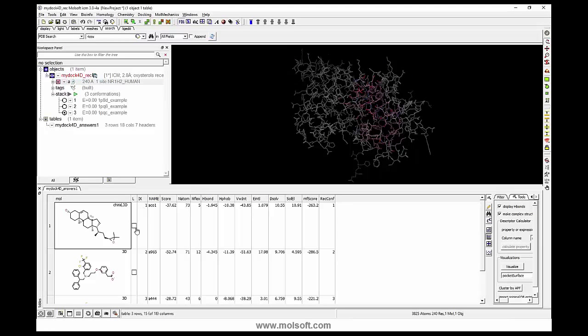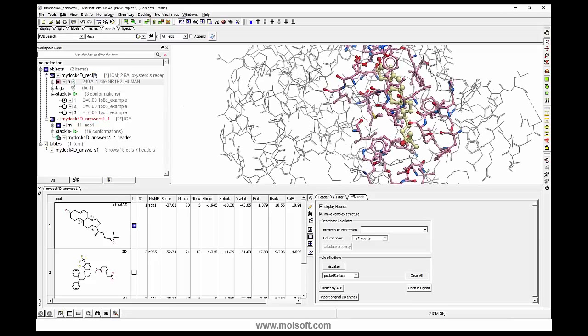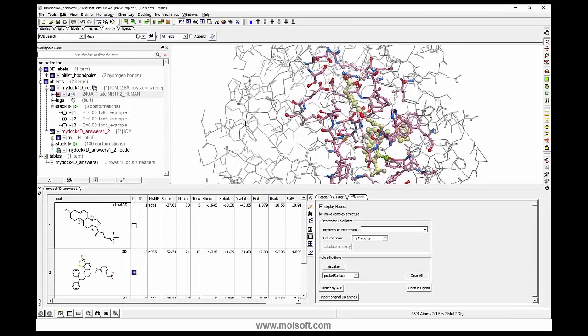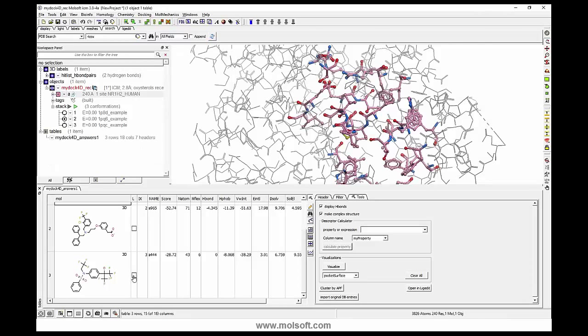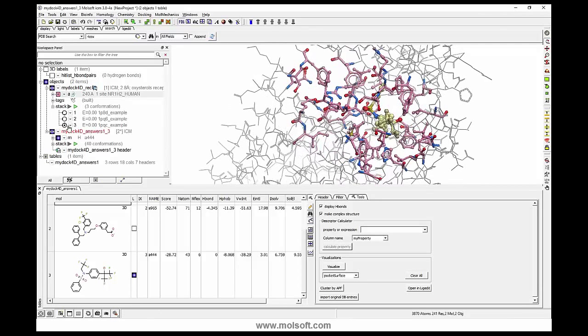So we can browse these. If we click here, we can browse, and you can see that this is showing the ligand docked to receptor conformation 1. If we unbrowse that one and go to the second one, this prefers the second conformation, 1PQ6, and it's docked there. Likewise for the third one, click here, and it prefers 1PQC.